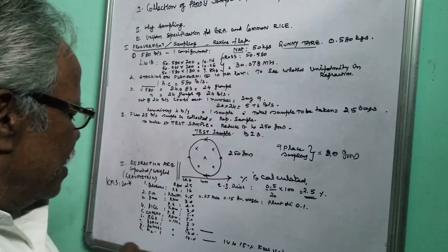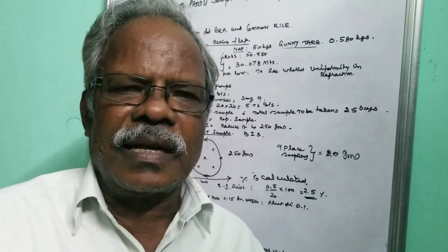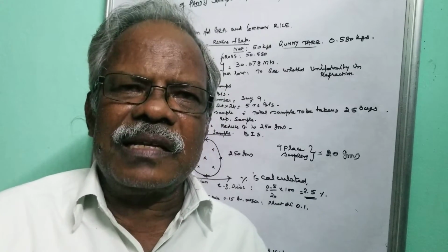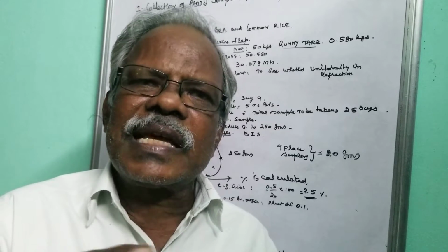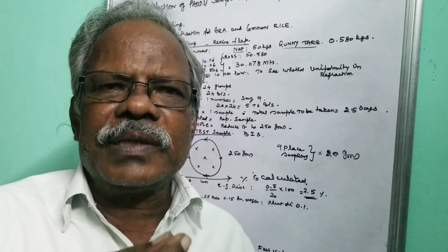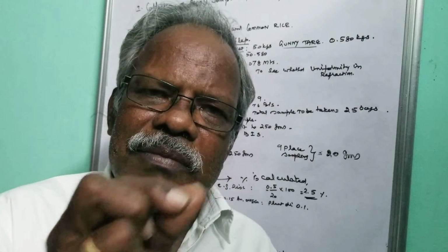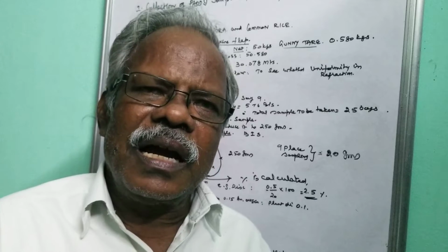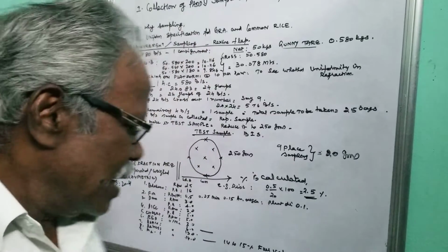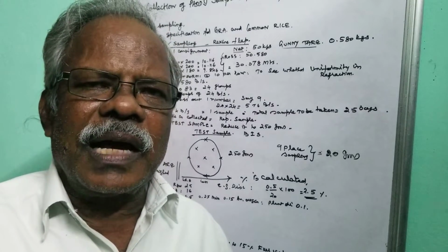And then admixture. Admixture will come only in grade A, not in common, because admixture means a lower variety is mixed in a higher variety. In grade A, for example, the LB ratio should be more than 2.5, and if it is less than 2.5, it is admixture. That is, bold grains are mixed in the nice or slender variety. That is called admixture. It should not exceed 6%, both in raw as well as boiled.